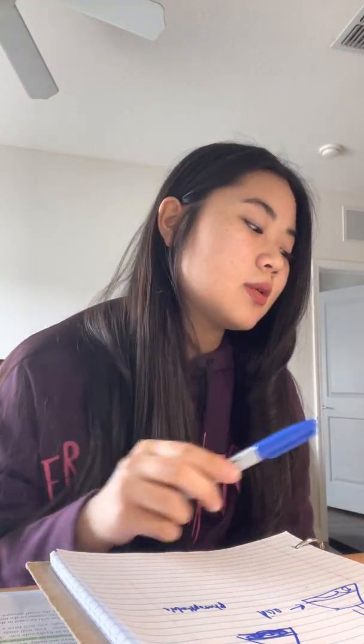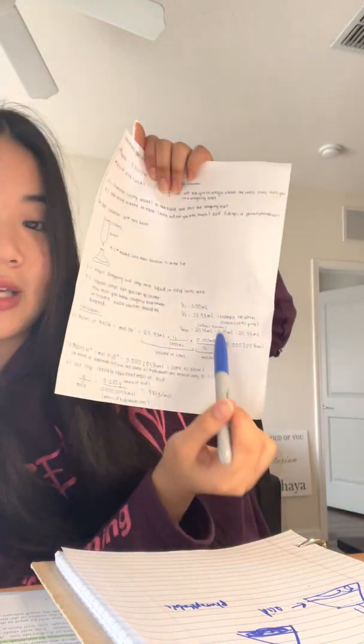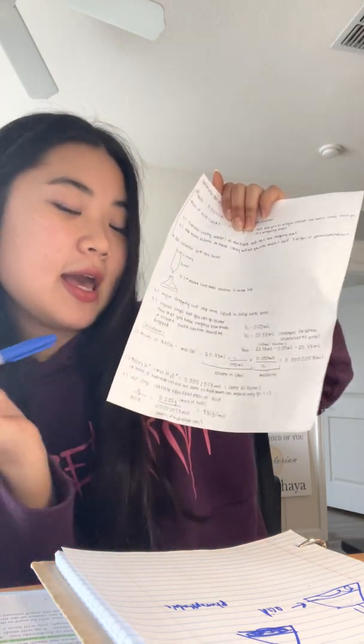For the last step, to calculate the equivalent mass of the acid: it is simply the mass of the acid divided by the moles of hydronium or hydroxide ions. The mass of the acid you already measured at the beginning of the procedure, and the moles of hydrogen ions is what you just calculated. Divide the mass by the moles and you get your answer — that is basically the whole lab, and if you do this you will pass.